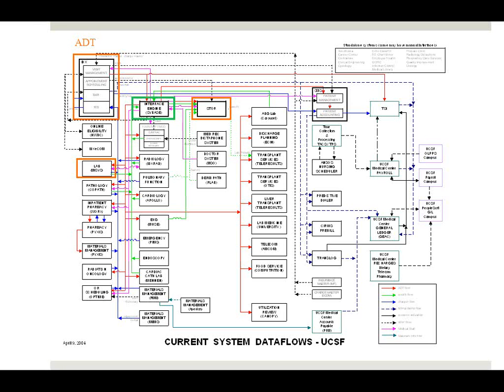So although we had separate systems, they all went through an interface system, and now this functioned as the centralized data repository. If you renamed this as Apex, that's where Apex sits. So we still talk through an interface engine to Apex. Okay. This has gone away because this is now part of Apex, and I'm going to get an updated one of this. But you can see how complex the system is.